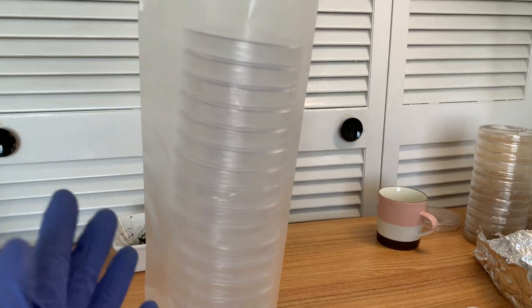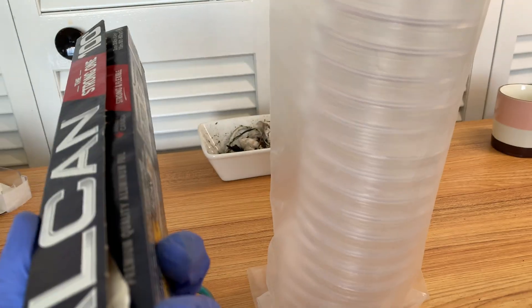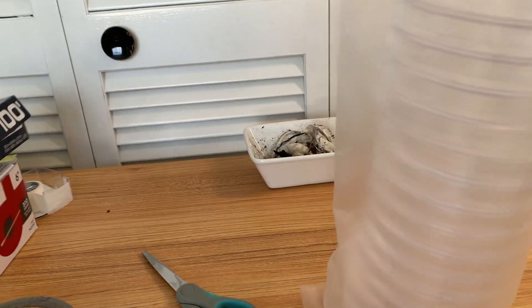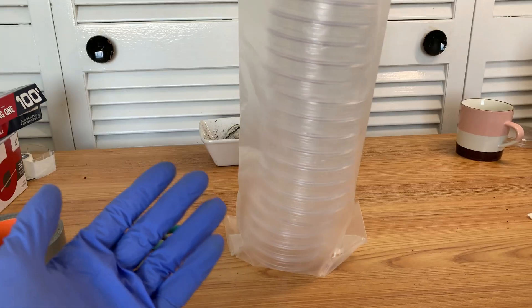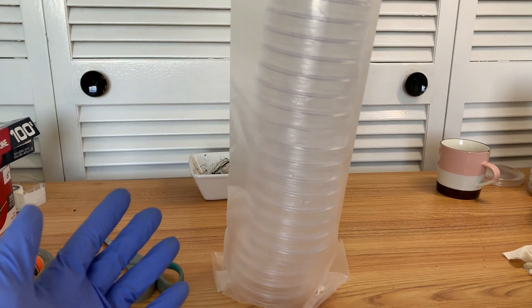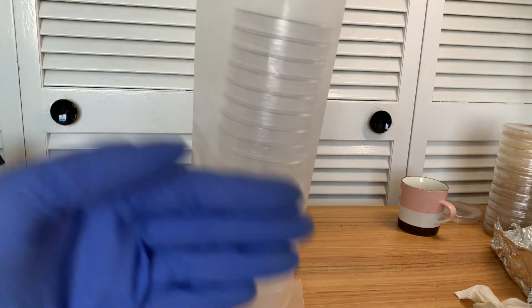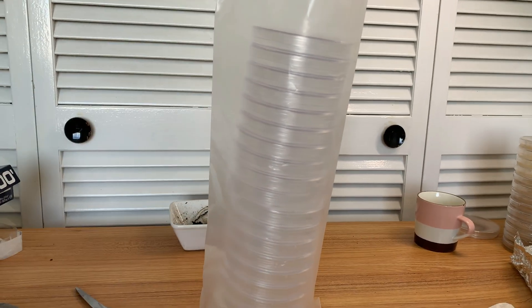That's just to illustrate how there's a lot of disposable stuff. Another thing is foil — we use a lot of foil in this hobby, so I want to show you guys how you can reuse it and when you can reuse it. There's also gloves and masks, topics I eventually want to cover as well.